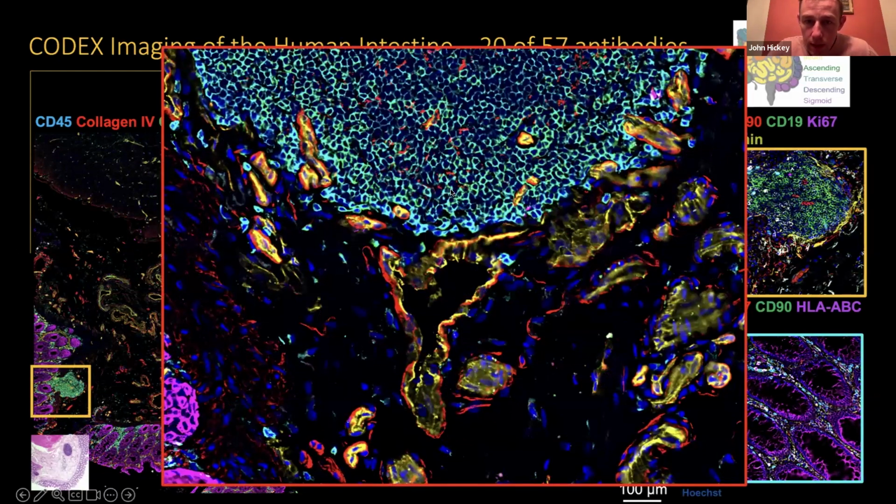If you see these individual little circles, this is an individual cell. Here, these are immune cells all working together in what is called an immune follicle. And then here you can see these long cells all next to each other. These are endothelial cells, which are vasculature. You can see this big hole, which is a blood vessel, and that's where your blood vessels are transporting nutrients.